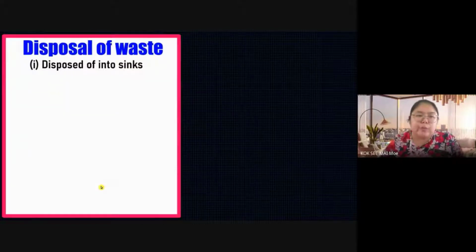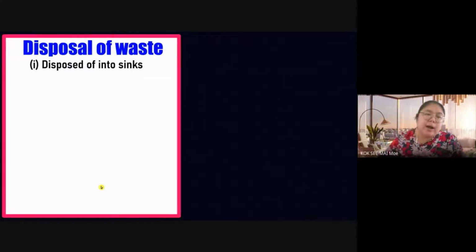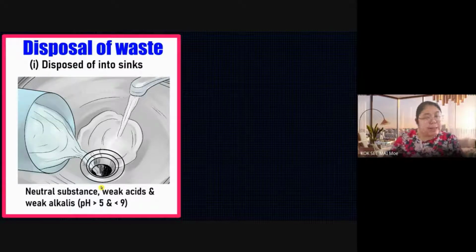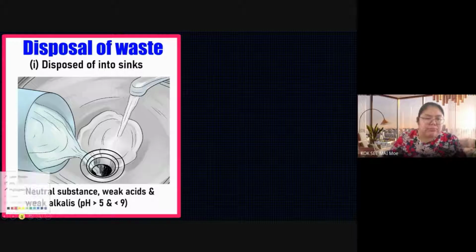Okay, disposal of the waste is separated, the first part they say into the sink. Which one can we straightforwardly throw inside the sink? Which one we cannot? So now we're going to see the first part. Okay, straightforward, pour inside the sink. Let's see it. Okay, neutral substance. Neutral substance, example, water. Water is a neutral substance.